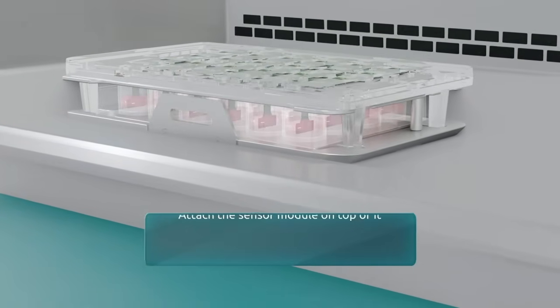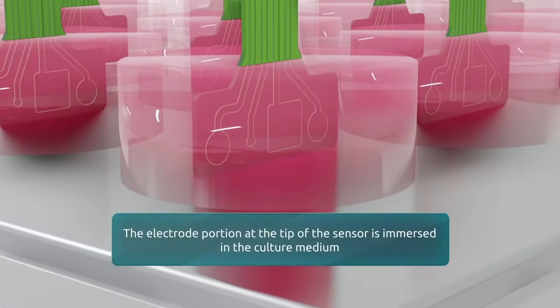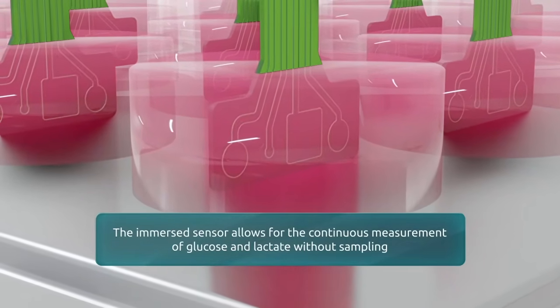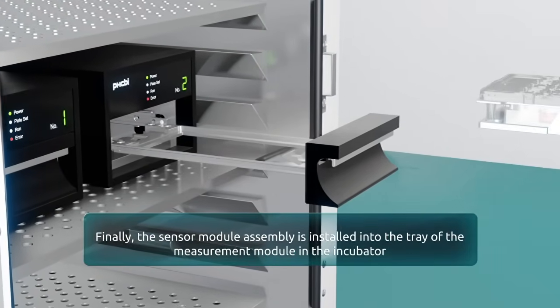Cell cultures can now be monitored continuously without sampling the media. The detector is housed in the chamber of a CO2 incubator so that glycolytic changes can be evaluated directly.